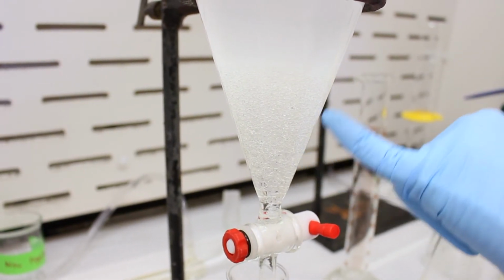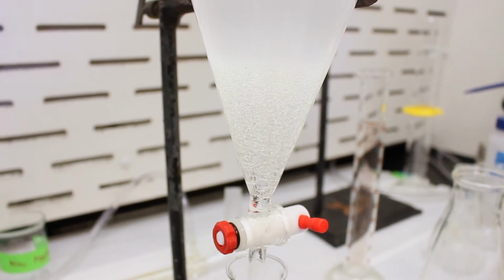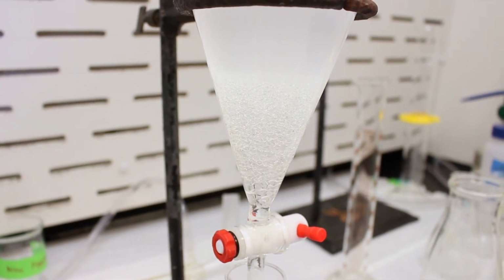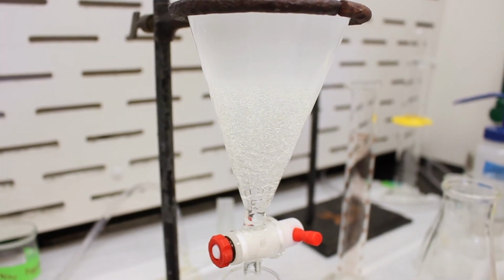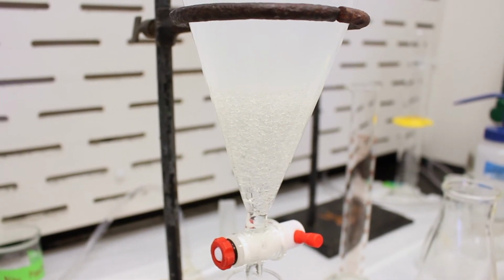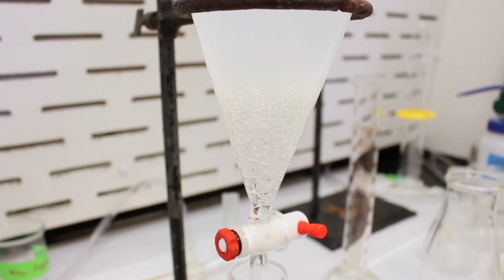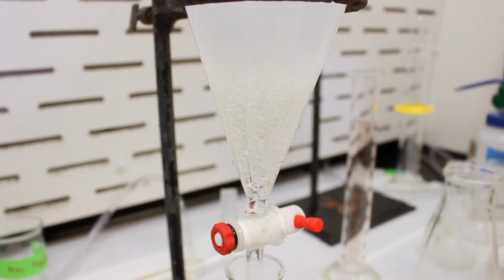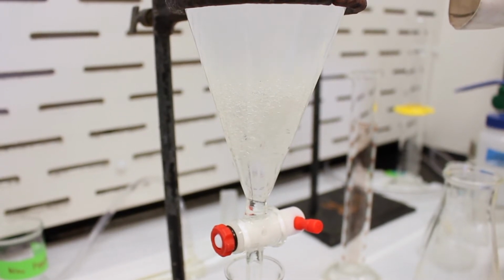Of course, there's still a little bit of an emulsion here. I think we'll add a little more brine. And we'll take this pipette to try to agitate the bubbles, kind of coax them back into their own layer.